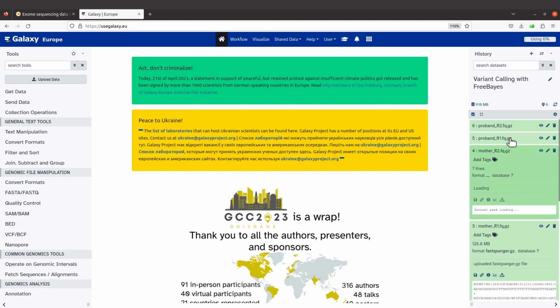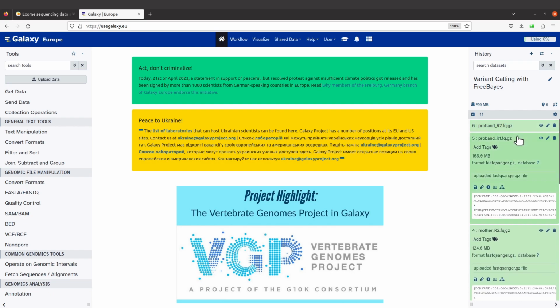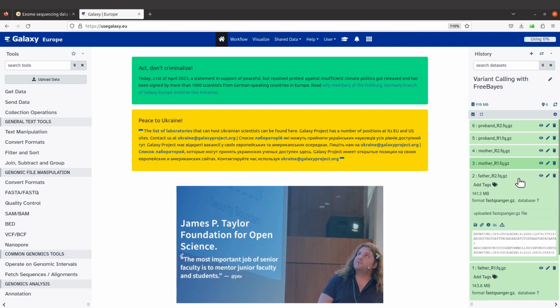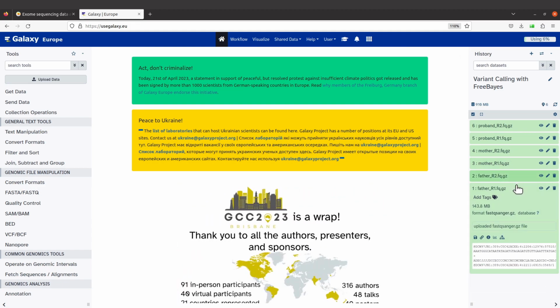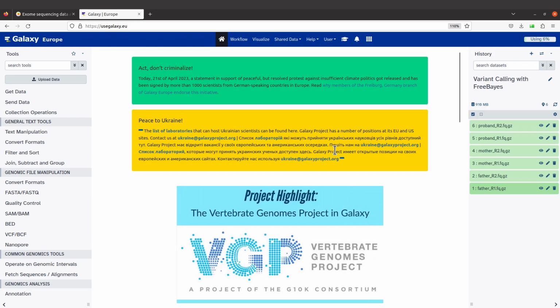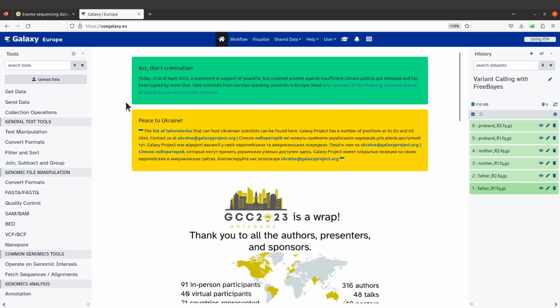That one is up to you. Here we are dealing with just a small number of samples, so you can manually check each of them, right? But everything's fine. If you have lots of samples, then you can do that setting, or you can check that setting when you are importing. We did not do it in this tutorial because I knew it will work fine, but just make sure to do that. Maybe another tutorial will show you how to do that, but for now, things are looking good.